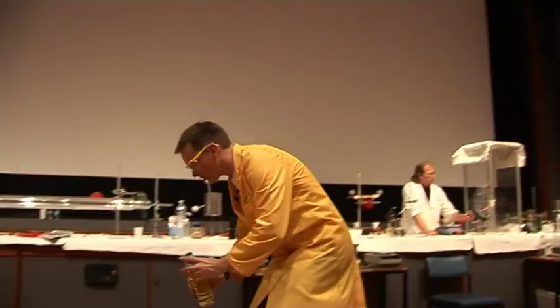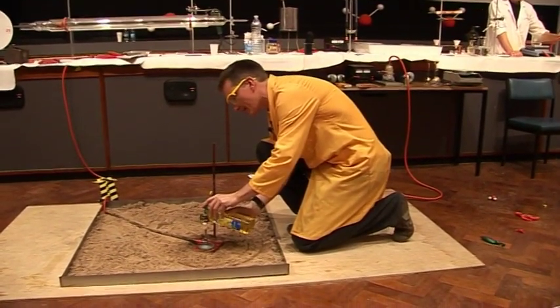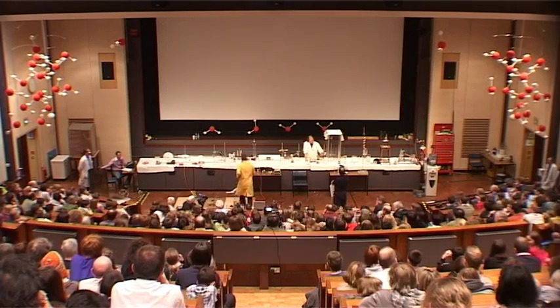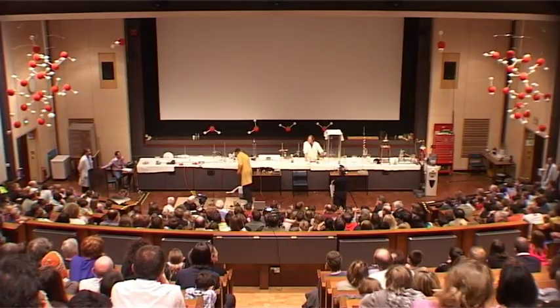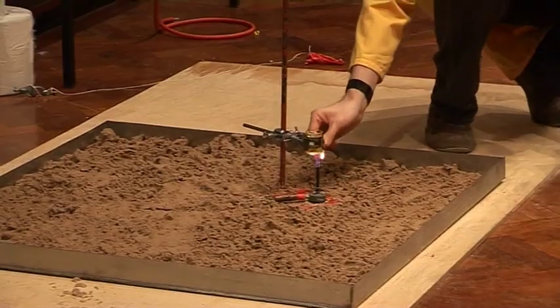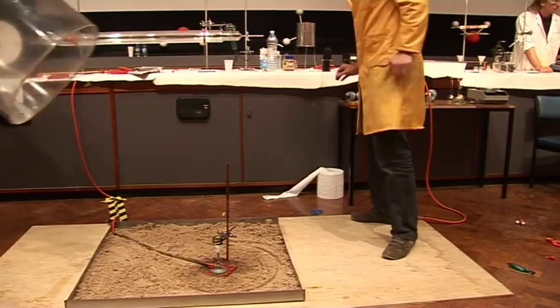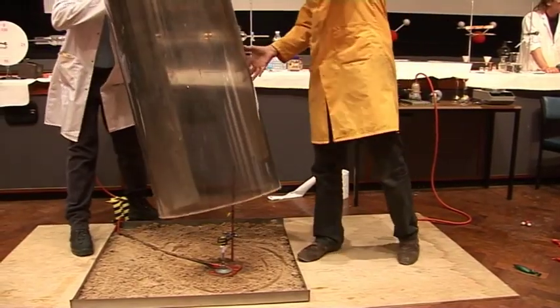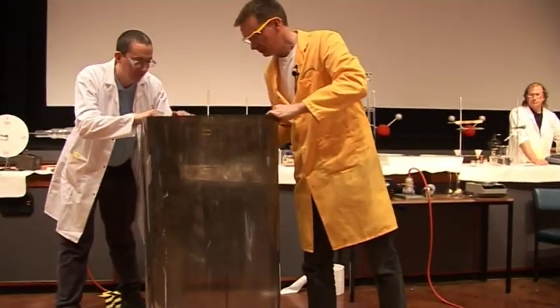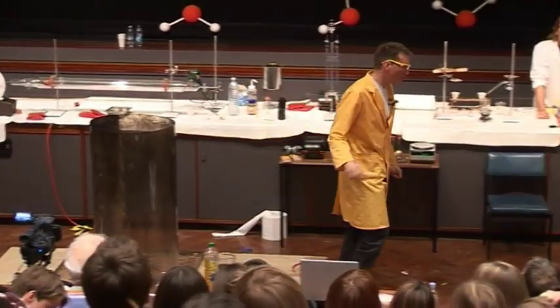So we've got one down here already. I'm just going to put some oil in and get this heating. Oops. Okay, so just put the Bunsen on. There we are. Get that ready. Okay, better put a screen around it just to be safe. Okay, wouldn't want any accidents. Okay, perfect. Thank you. So that's the oil heating up. We'll come back to that later.